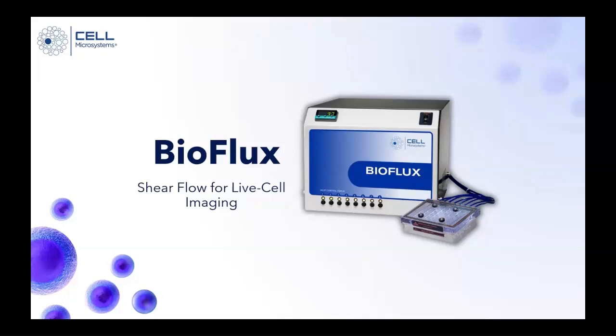I guess the limitation of the cells would be the size of the cells, as I mentioned before. We would have to ensure that they would fit through the microfluidic structures of the plates. And then it depends on the application. So for example, for this experiment, when we were creating the monolayer, that's best done with an adherent cell line.